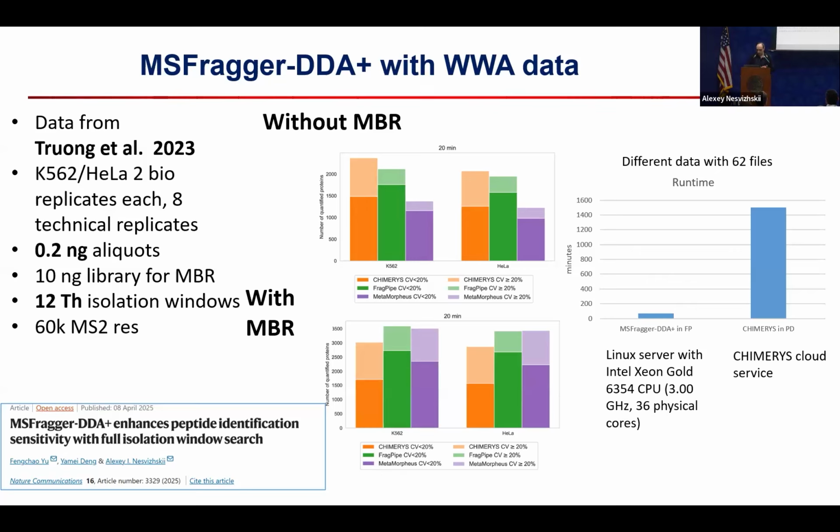So Chimerys was capable of processing the data, but was extremely slow. This work we published a few months ago on DDA Plus, where the single-cell focus kind of faded in a sense, because the field transitioned to other data acquisition strategies for single cell.